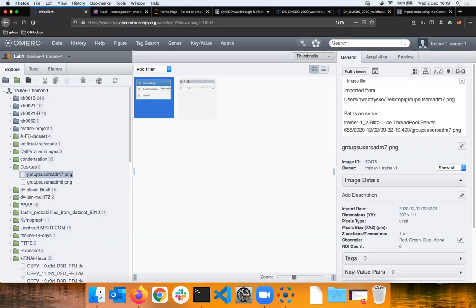The in-place import can be done only via the command line interface. Okay, and I never showed it. Yeah, it's a bit more involved. You pass a command, like when you do a symlink, in a sense. There is no import in the web. What Peter is showing in the web is the result of that import, indicating what type of import it was.